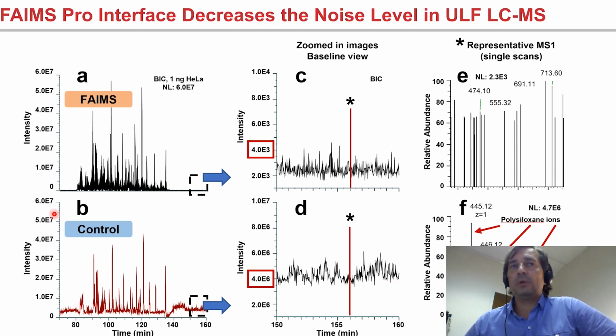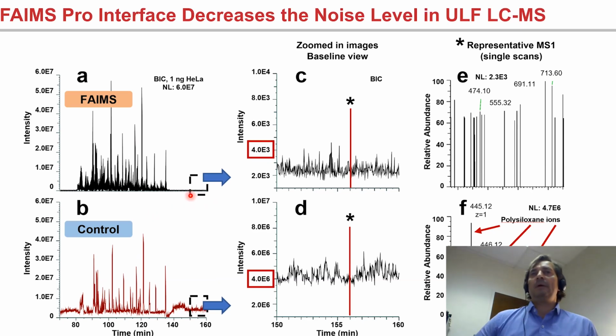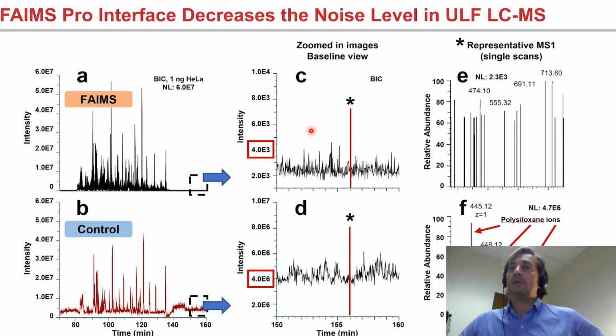But nonetheless, the overall intensity is fine. Then if you look at any empty region, retention time range on the LC-MS chromatogram, in this case, I'm showing an example from the end of the gradient after all the peaks are eluted and the column got equilibrated. We did the same thing running blanks in the middle of the gradient. And what we observed is that the signal changes about 3 orders of magnitude, just the baseline signal.